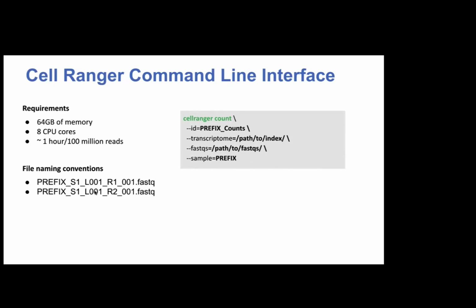And then, because it's paired end reads, as I said, you need this kind of convention of naming your reads. Otherwise, it doesn't work for me. But there's extensive documentation on their website. But to keep it simple, this is kind of what this looks like.